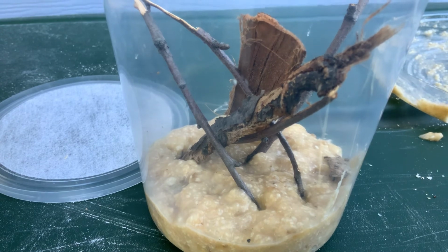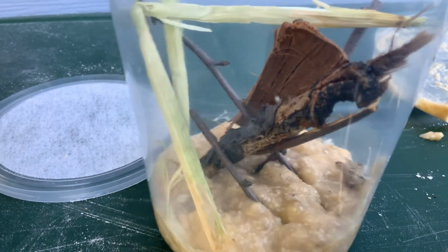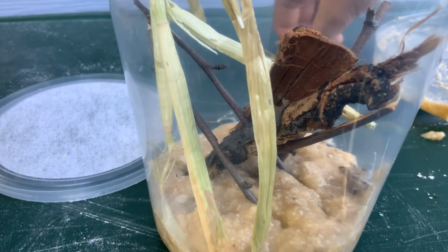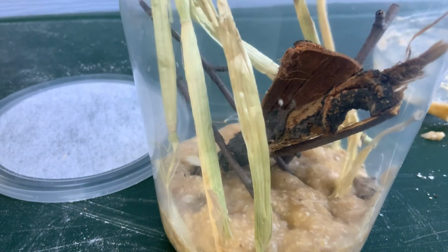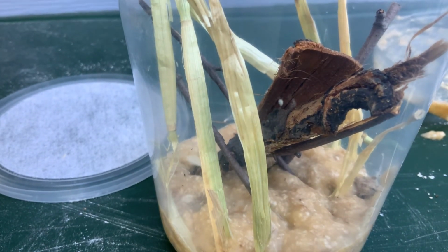And maybe put in some straw for them to climb on, just for fun, I guess. If you want your flies to have fun, whatever, you can do this. The pupae are pretty heavy, so I might squash down some of the straw after a while, but who cares? That's okay.